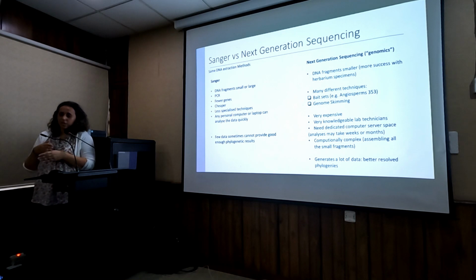But with NGS, you can try to put them into a certain size, but it only works if they're long and you're trying to shorten them. If you read them, you make a reading of the size of the fragments, and it tells you it's like 40 base pairs long, 100 base pairs long. That is so short, it probably won't even attach to the primers properly. And that means you can't amplify it. It means that the library preparation is going to fail. So this is what seems to be the problem with too much fragmented DNA.